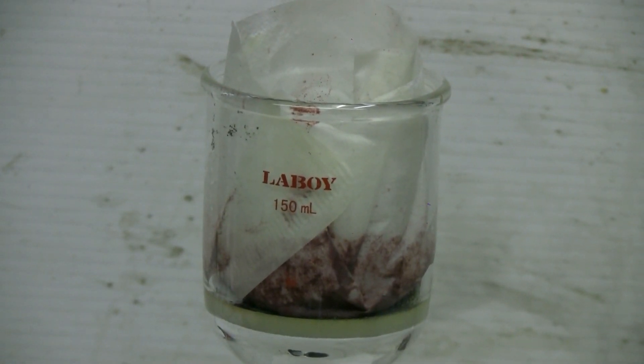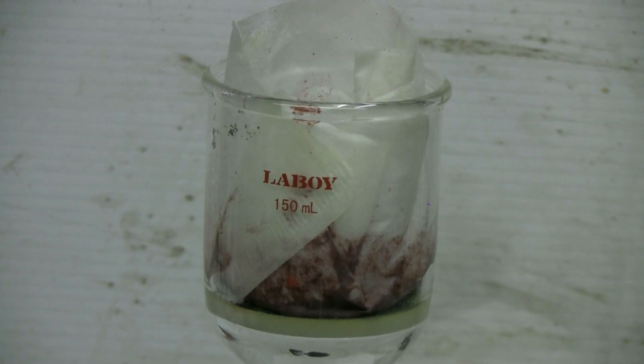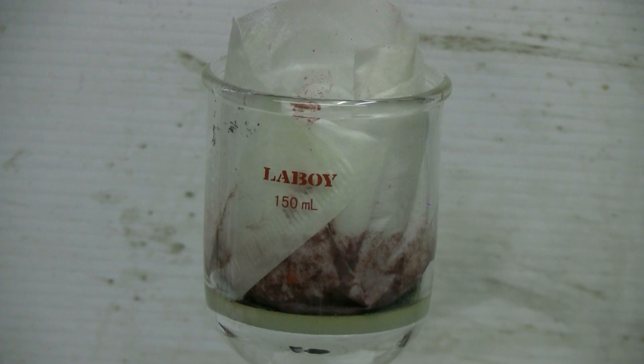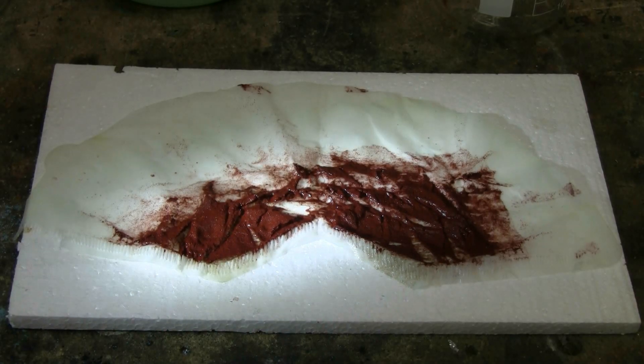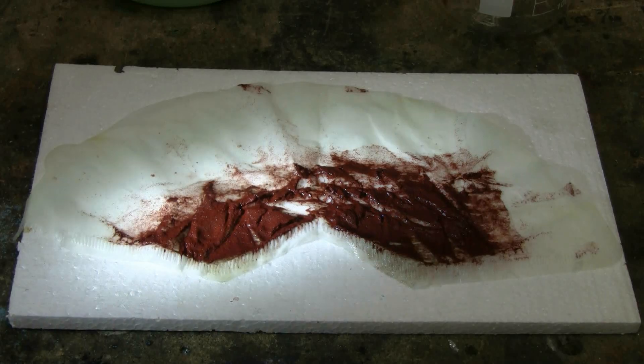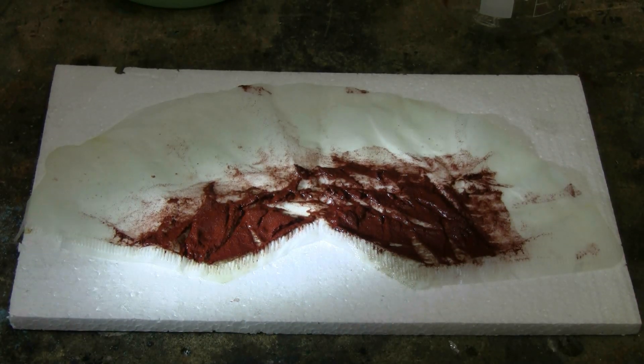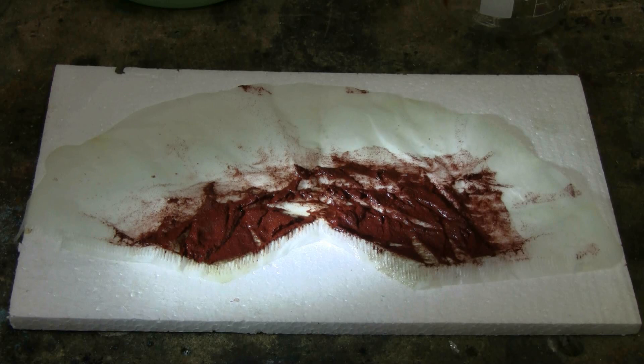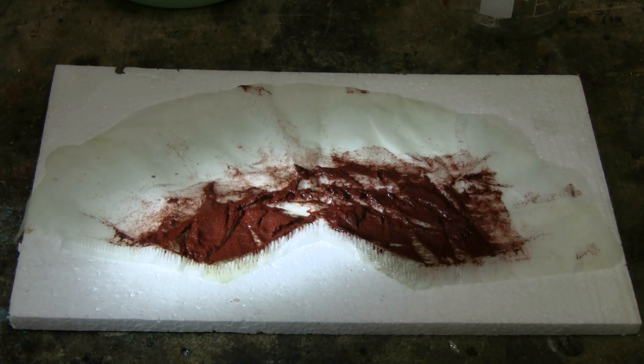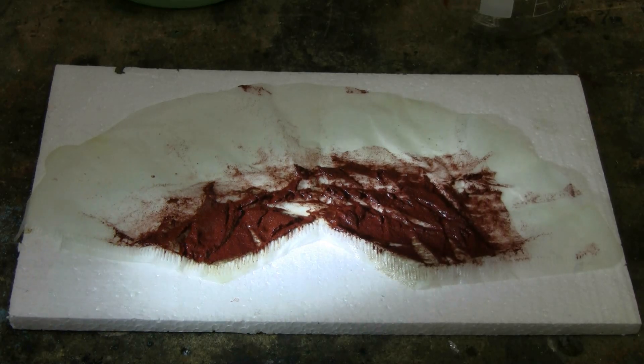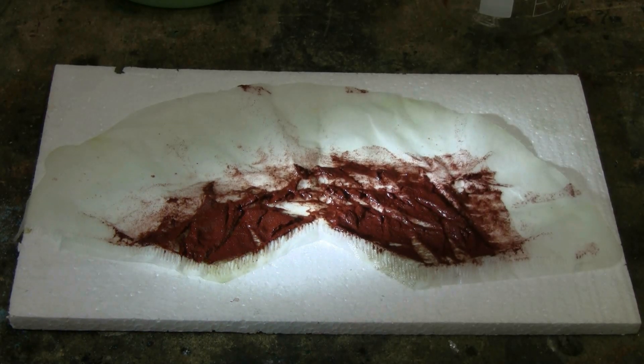The Chevreul salt is now in the filter paper. I'll stop vacuum filtration and get a look at the product when the filter paper's been spread out. Here's a look at the recovered Chevreul salt on the filter paper. As we can clearly see, this is a brick red in color. An interesting color for a copper salt.